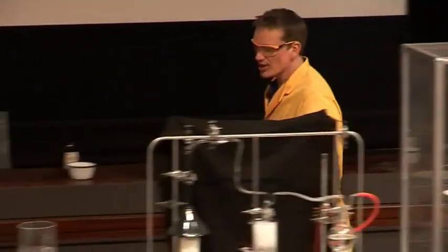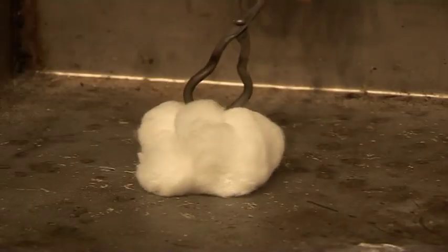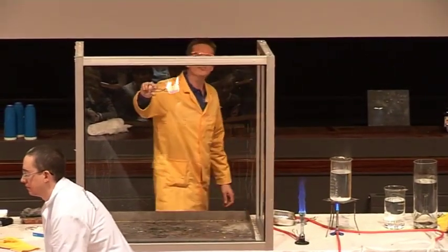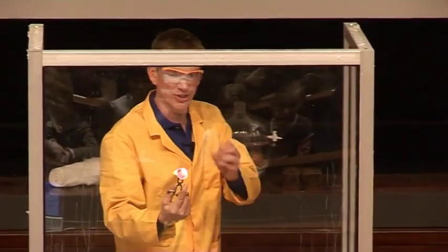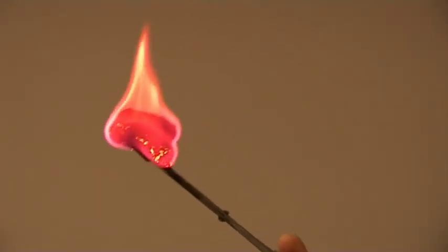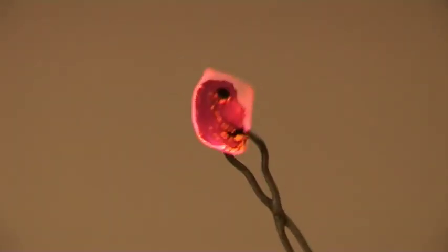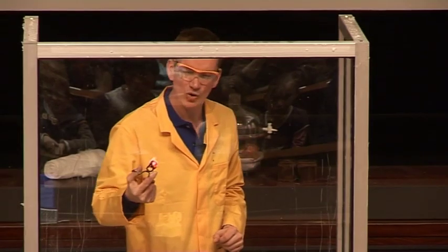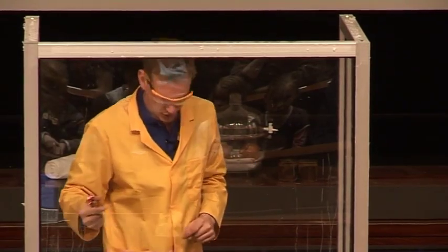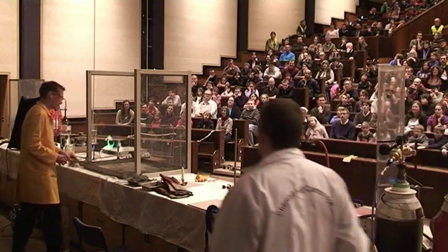So many things burn. Have some cotton wool here. Not terribly exciting, but it does easily catch fire. It doesn't burn really well. It burns quite slowly. It's not burning completely. It'll leave some black residue of unburnt carbon here. So it's quite difficult to get it to burn well, but we'll see if we can improve that later in the course of the lecture. So cotton wool doesn't burn quite so well.